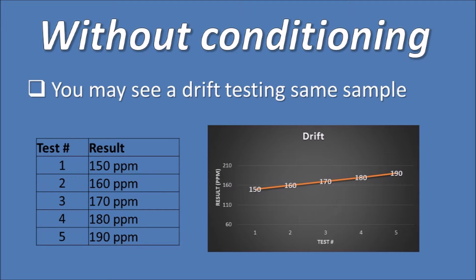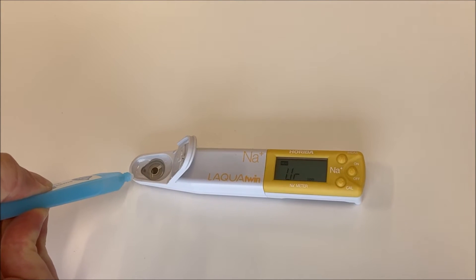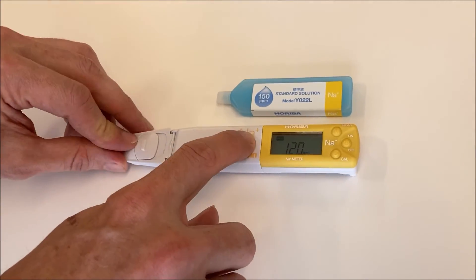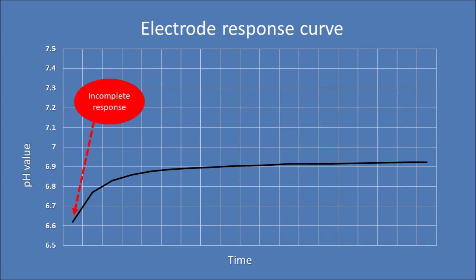Using a meter after storage without electrode conditioning will cause drift. Drift will be observed in repeat measurements during the check control procedure with the calibration solution. The meter will display different values, usually lower than the calibration value. If the meter has drifted, it needs to be recalibrated. The drift is associated with incomplete electrode response during calibration.